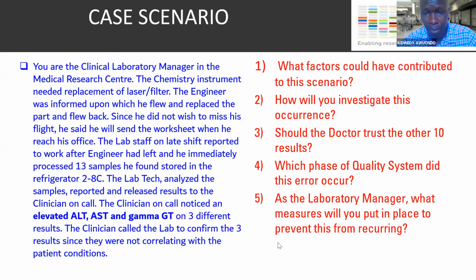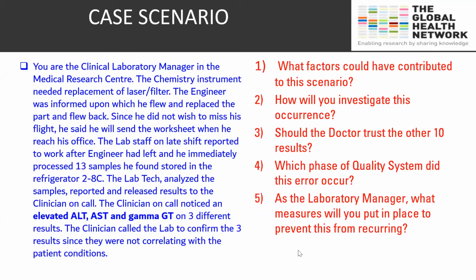That's one: lab personnel did not run calibration. That's correct. Any other answer? Okay, let's proceed to the second question.